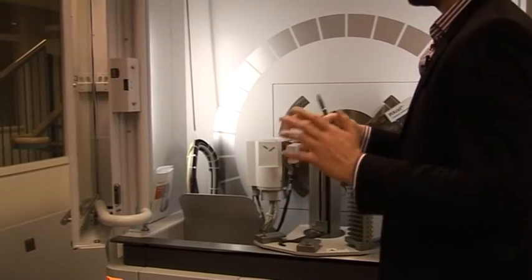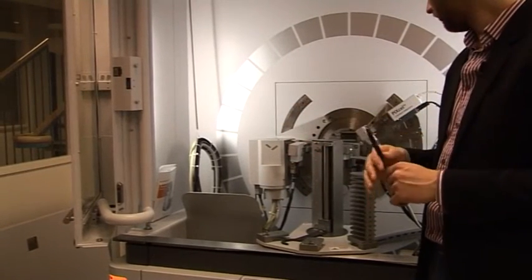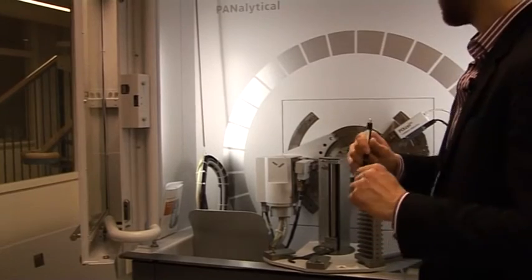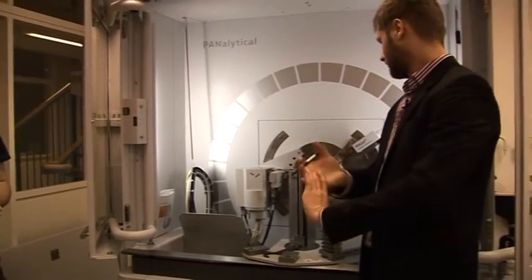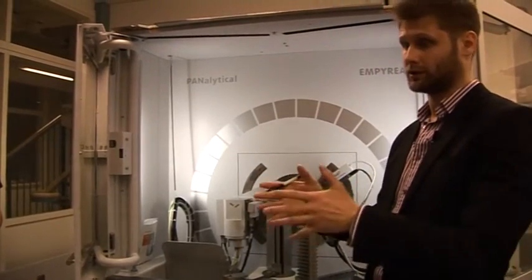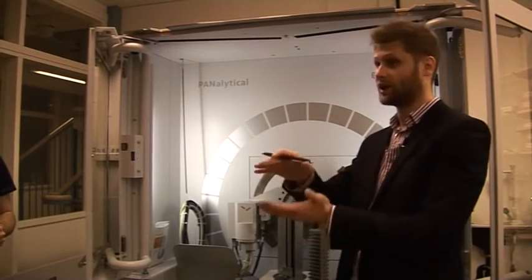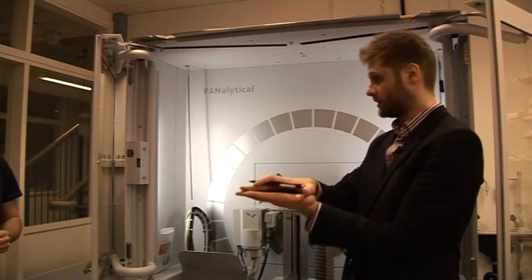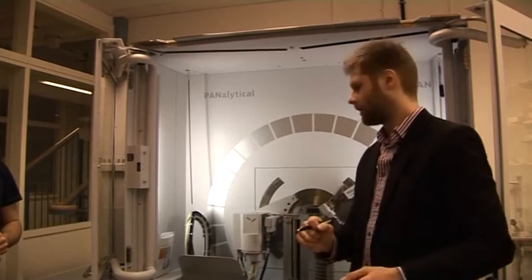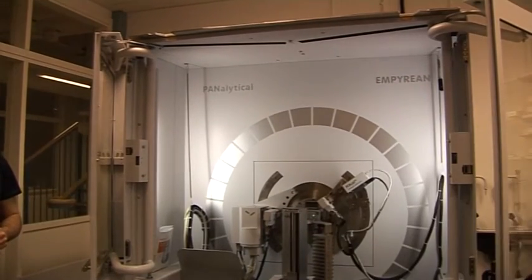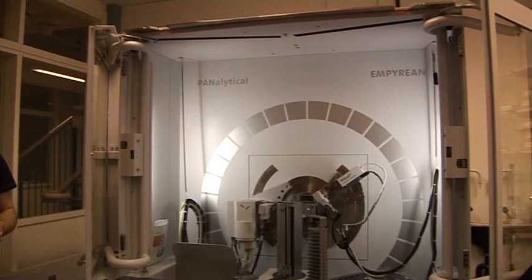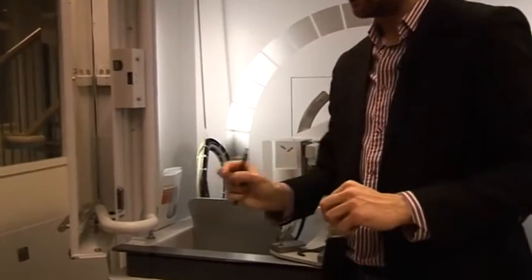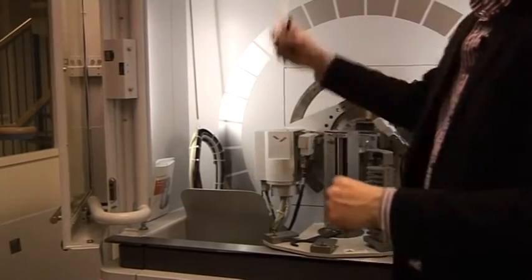The next component of any diffractometer is the system of optics. The main purpose is to make the size or dimensions of the beam the way we want it. For that we usually have different types of slits. The slit usually defines the length of the beam. If you have a very narrow slit then the length of the beam will be very narrow. We can also have beam masks that define the width of the beam.